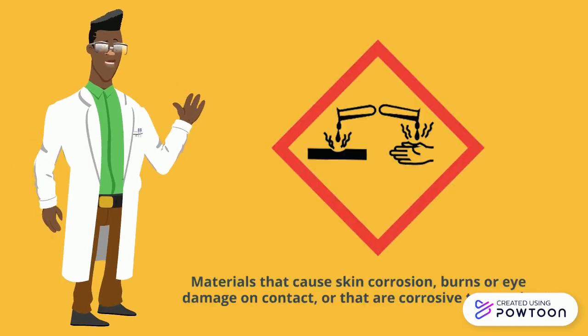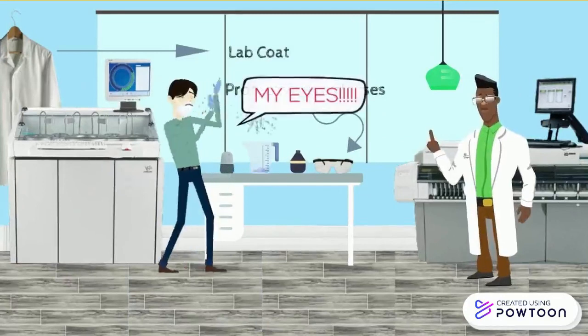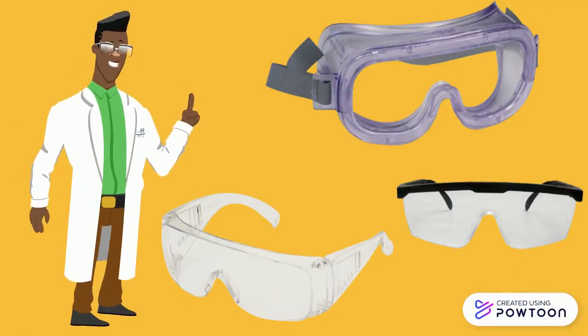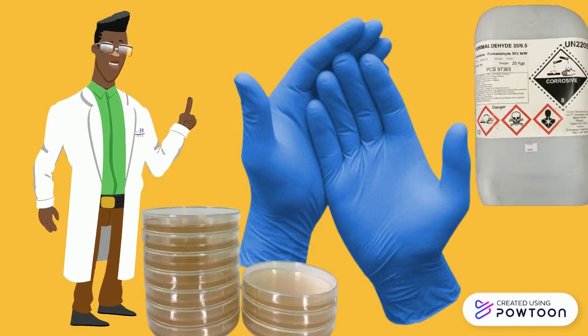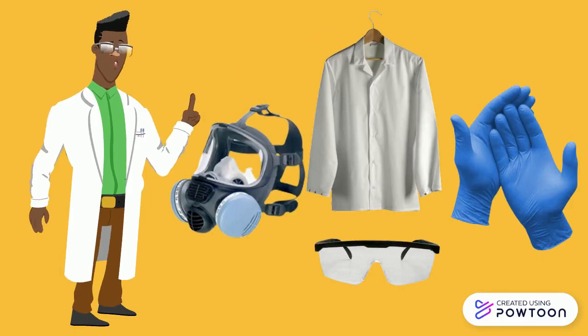Other PPE include white coats, which act as a barrier of protection for the individual against chemical and infectious hazards. Eye protection must be worn in situations where there is a risk of splashes. Examples of this include manipulating sample tubes when checking for blood clots in an FBC tube. And lastly, nitrile gloves are standard use when working with chemicals and patient samples. These PPE should be worn appropriately.